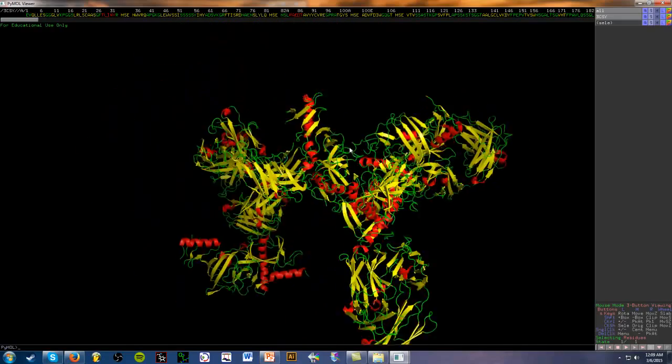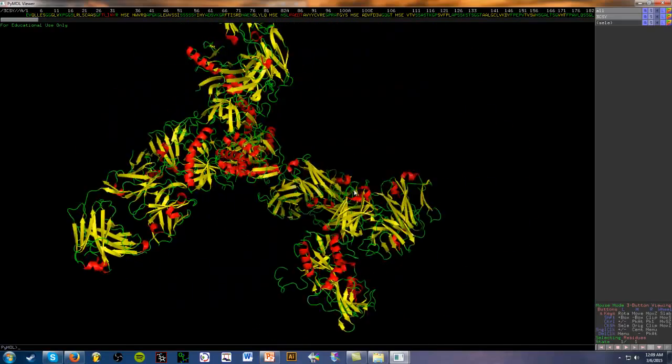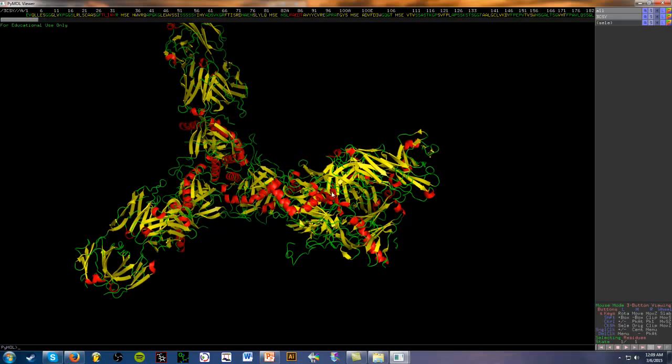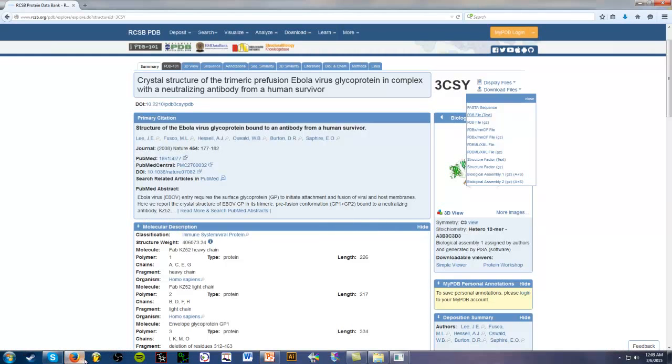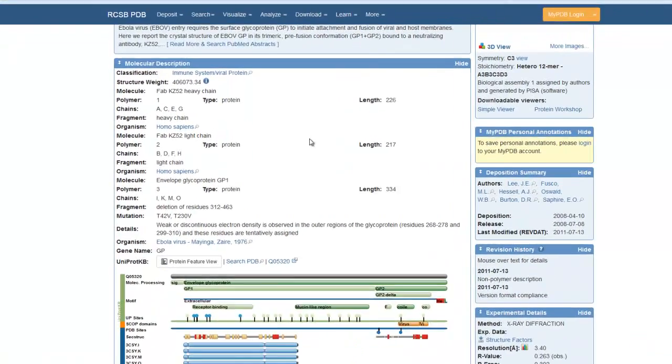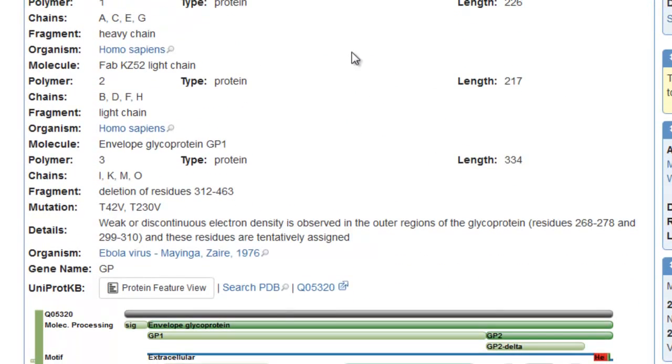But what are we really looking at though? What's going on here? We need to go back to the browser. So let's go ahead and do that. If we look at the molecular description here, we can see what these are.